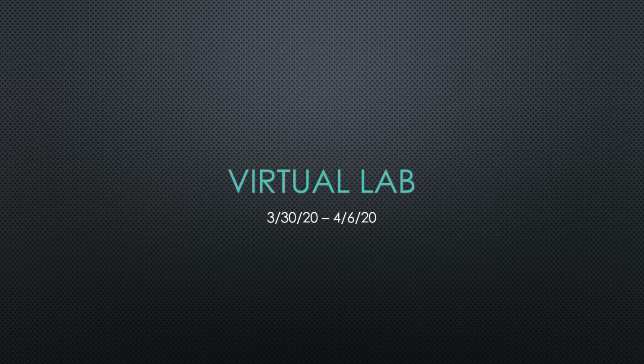For the next few weeks, we will be going through the lab experiments that we would be doing if it wasn't for the coronavirus pandemic. We will be learning about a series of biochemical tests that can be used to identify an unknown bacterium. You will be responsible for answering a few questions each week that go with the tests that you'll be studying. These questions are mandatory, as they will add up to replace your lab report points.